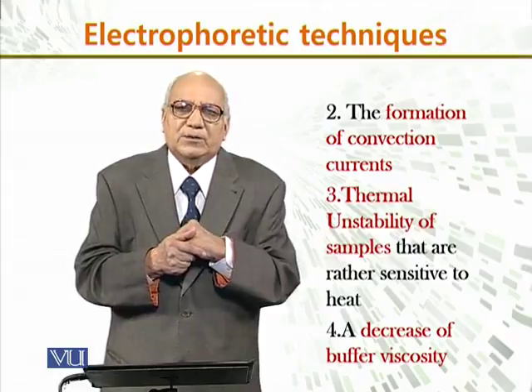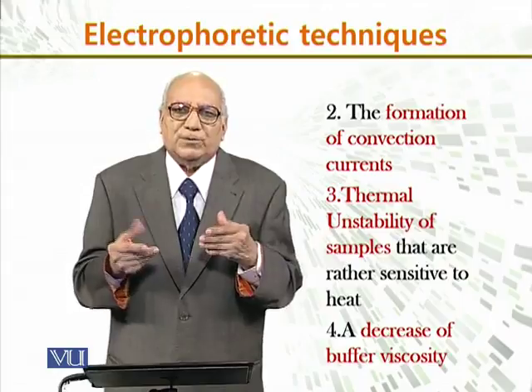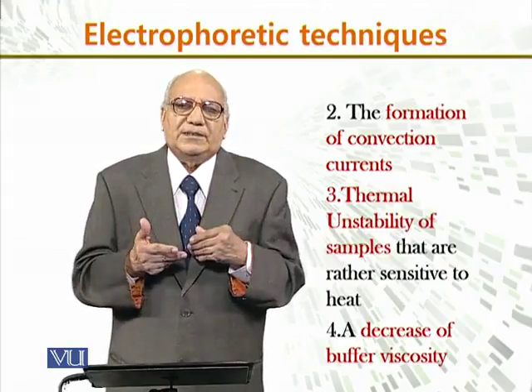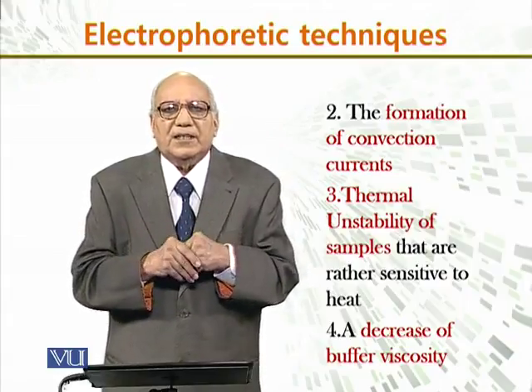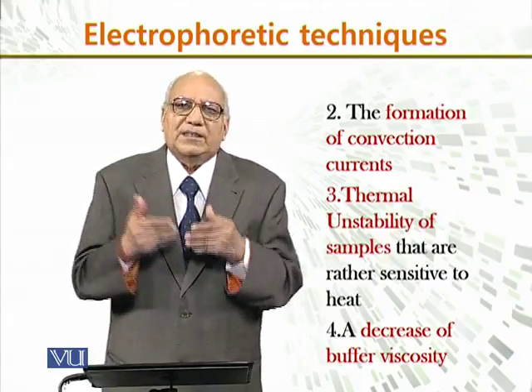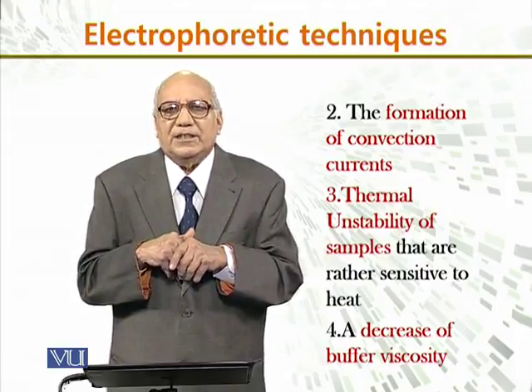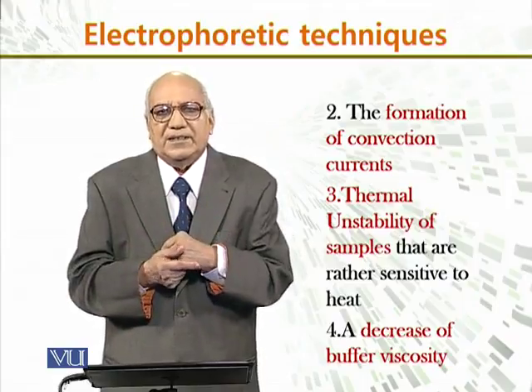So as a matter of fact, we see that this technique, electrophoresis, helps us to separate molecules according to their size and their charge potential, and it gives molecular biologists a very useful technique for studying proteins or DNA.